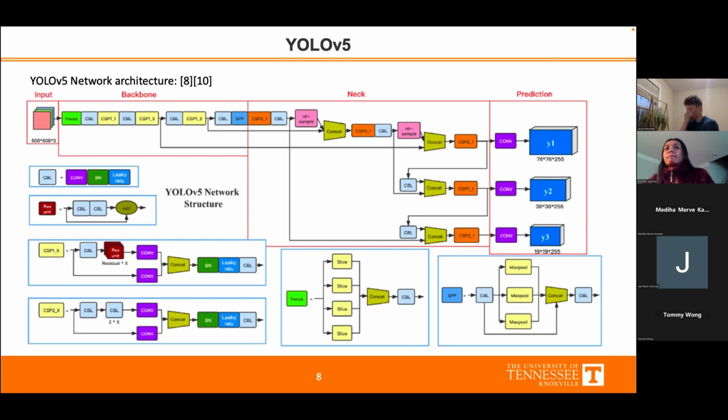So admittedly, I'm less familiar. I mean, I saw specific applications. It was defining the bounding box around the whole object. Once it has the individual features, it can define what type of object it would be, so then it can have the box around it. I'm less familiar with what specifically, like the why.